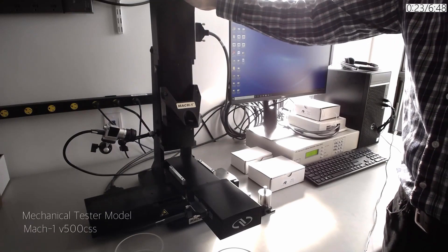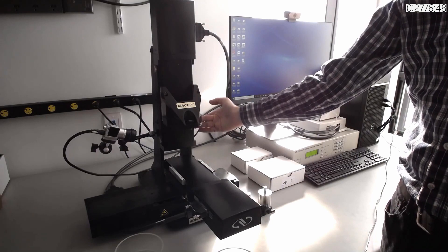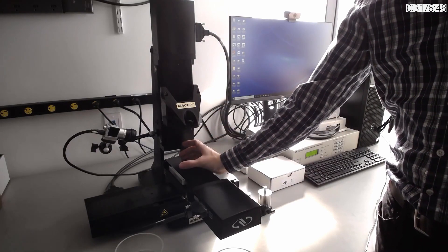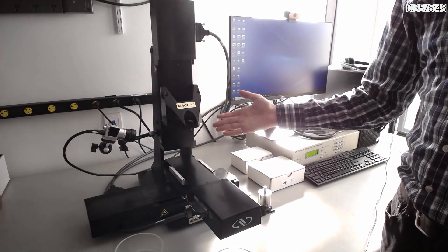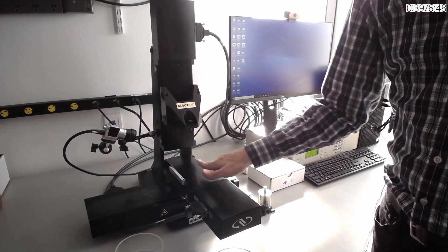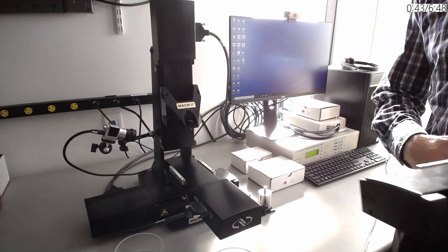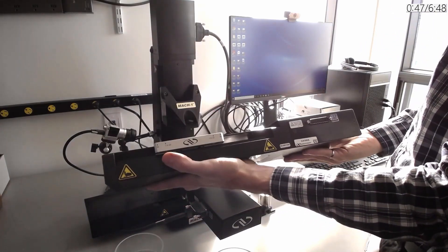This is one version of this modular testing system. The base model has only one vertical axis in Z with a load cell attached to the crosshead and then different fixtures to hold your samples on the bottom. This system in particular has two more axes, one X and one Y, to make two more horizontal movement options.